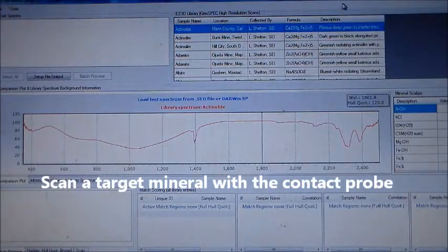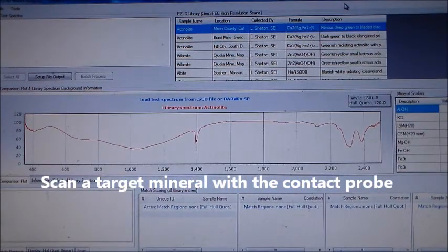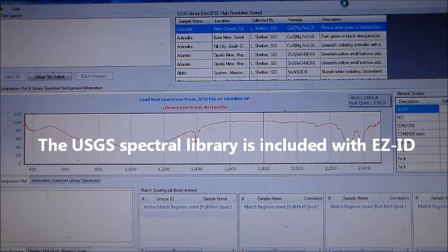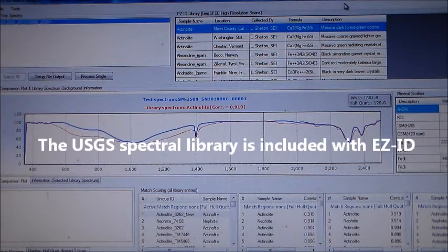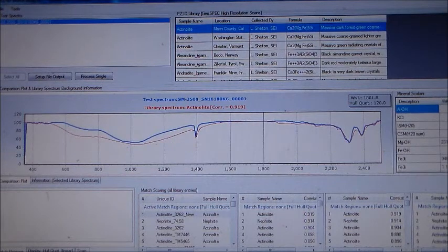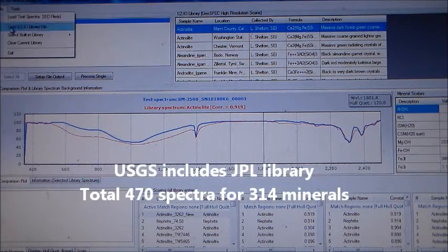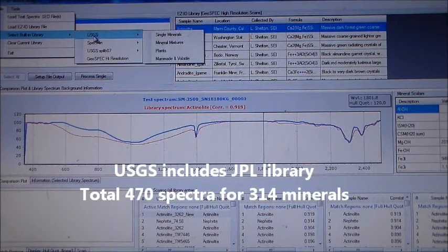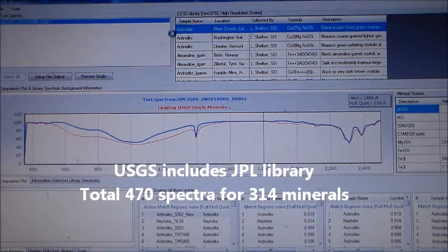Scan a target sample with the contact probe. EZID includes the USGS library for pattern matching against known samples. The USGS library includes the JPL library for a total of 470 spectra for 314 minerals.